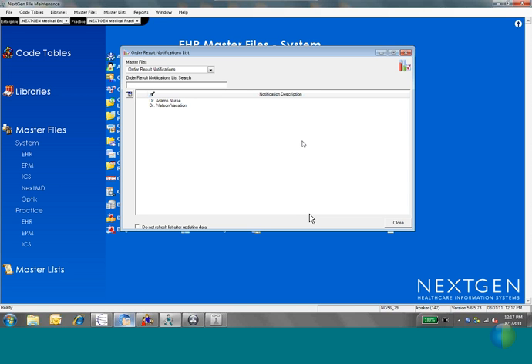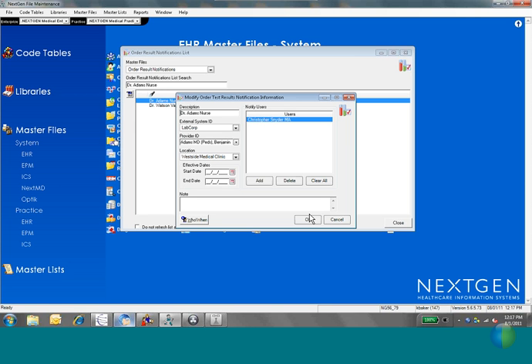So the idea is exactly the same as the Workflow Manager, and that came out much after this particular table. So again, you only use this table for tasking. It does not affect the PAQ. And when you go to create something, it's pretty simple to do it.